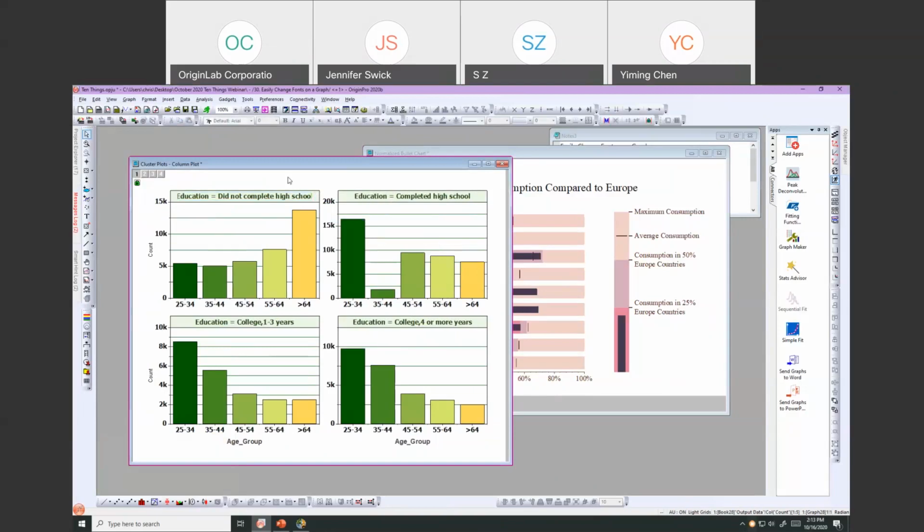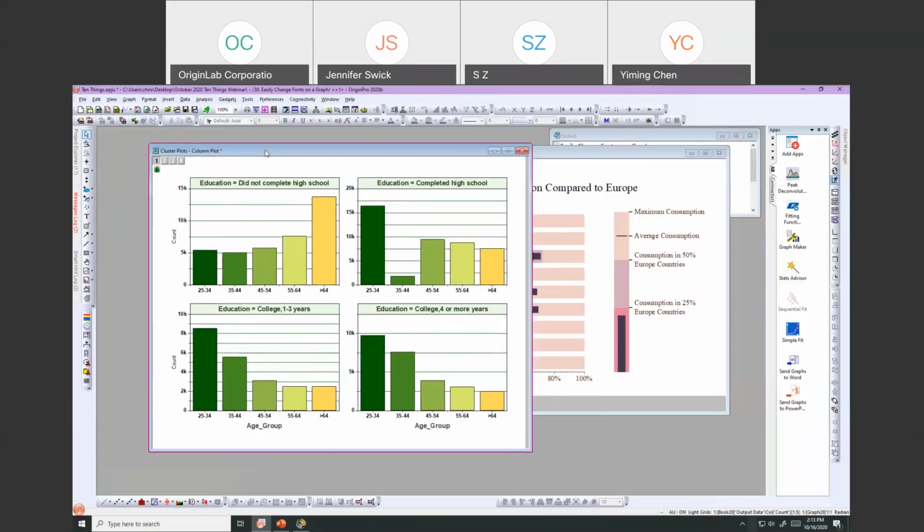It really depends on which you select in terms of whether it's going to change the font size and font face. And I believe we can just hit undo to undo these changes if we're not happy, and then we can redo them. Generally speaking, the actions you perform with our mini toolbars are undoable. So that's how we can change the font everywhere at one time.